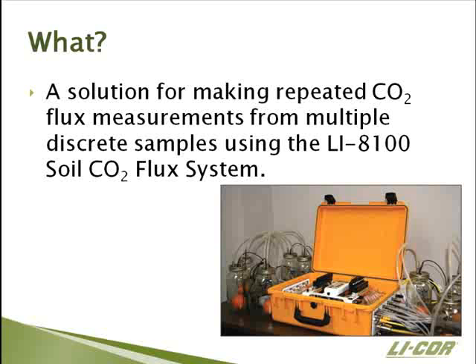With these modifications to the system, samples are placed in sealed chambers. And so you have a discrete sample in a sealed chamber. And rather than looking at temporal and spatial variation, now because you're looking at multiple samples, you can still make repeated fluxes, so you still get the temporal variation component, but instead you get a high throughput system because you can make measurements on up to 16 samples at once.